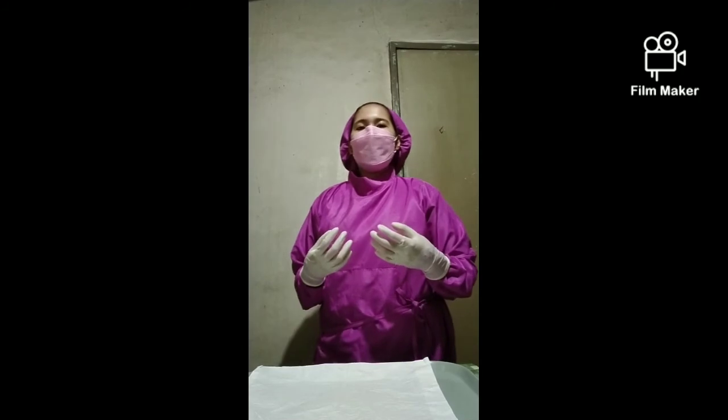Working in sterile attire, keep hands in front and above the waist level and below the axilla to avoid touching any object and prevent contamination of the sterile objects. Do not turn your back on the sterile field. Pass front to front or back to back with others in the sterile field.